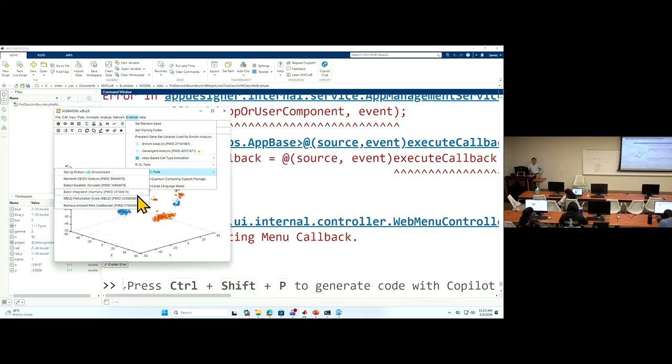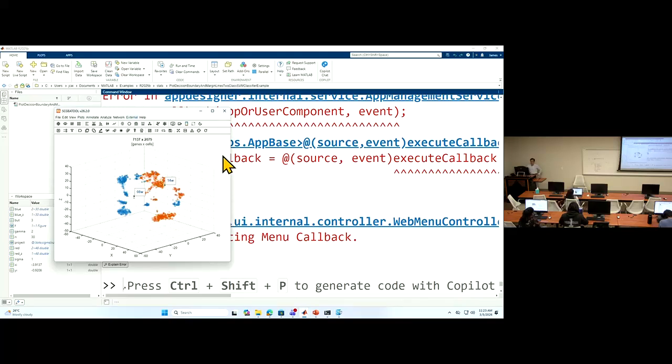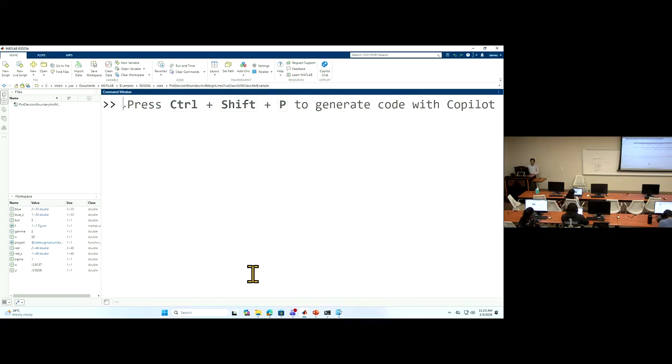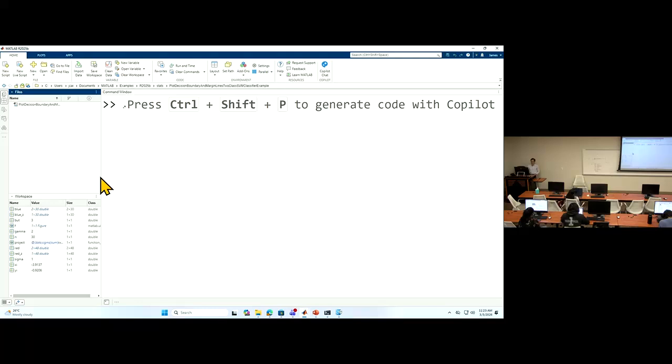You have a problem with the installation of Python and different version compatibility. You pass on the parameters, and the results may not be successful. So there are issues, and I believe there are better solutions using this web coding now.